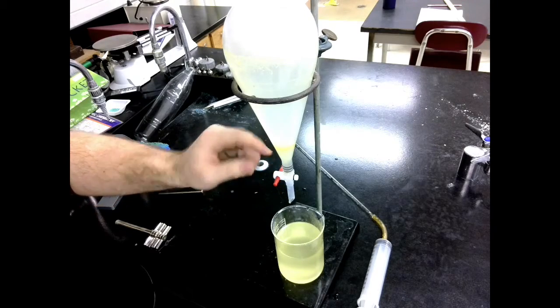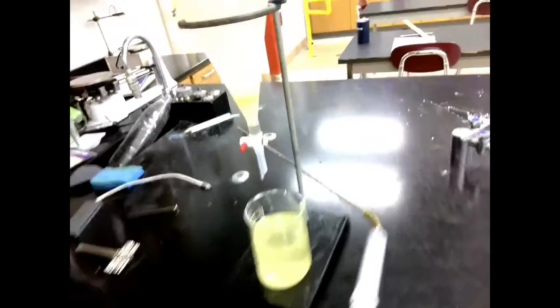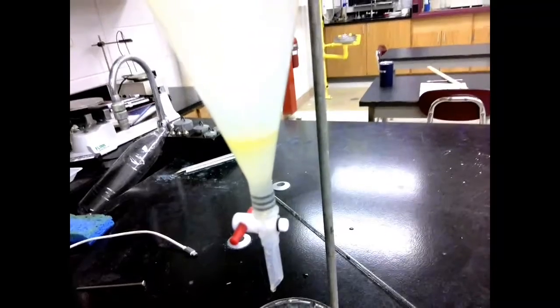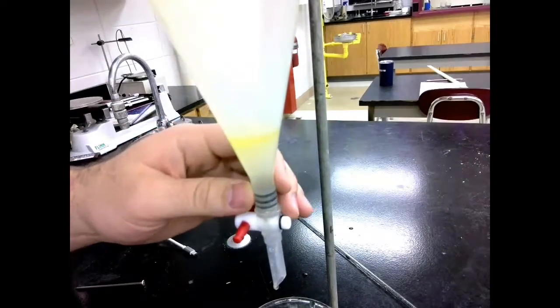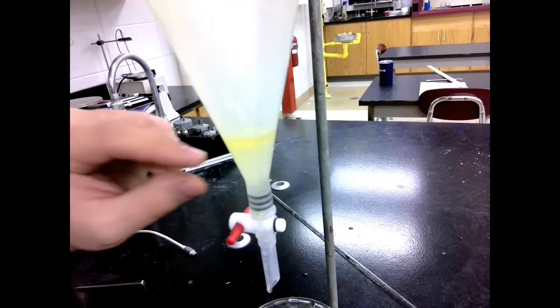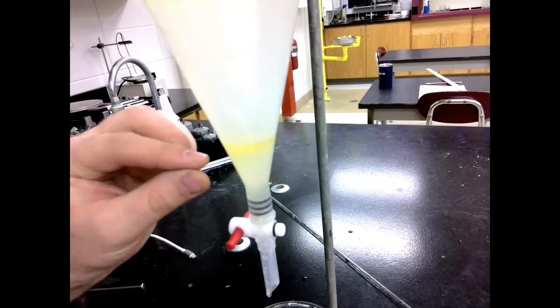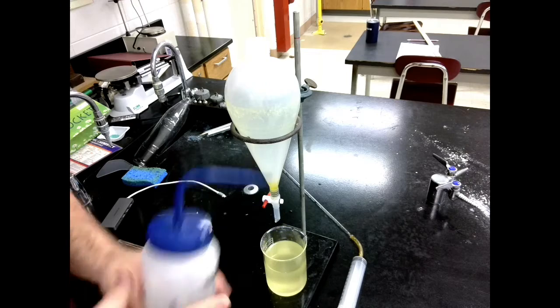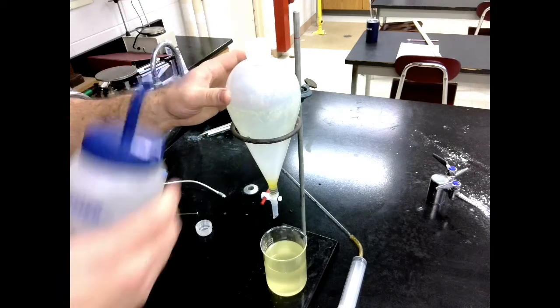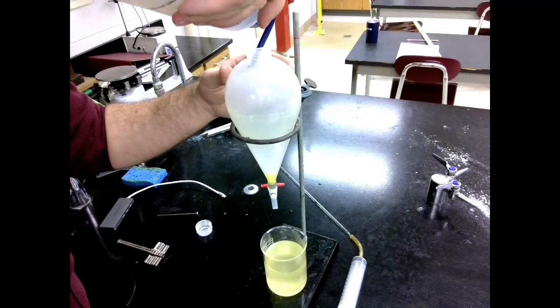Now, if you notice, the closer we get to the bottom, the more pronounced my layer of oil is. But because it's been moving down so much, this can mix a little bit. So once you get down to this last little layer, give it a little bit of time, just a few minutes, to separate again. So now I'm going to take my wash bottle, and you see this excess built up on the side. I'm just going to rinse that off so that it can move down to the rest of the oil, so that I can collect all of it.